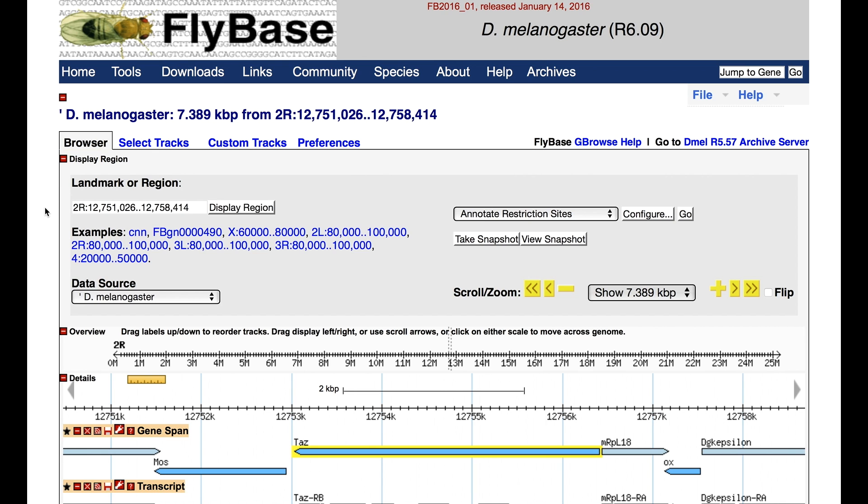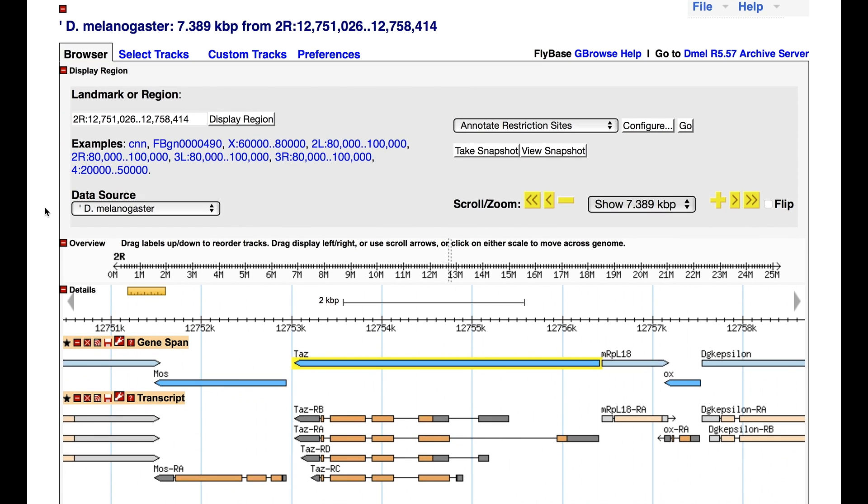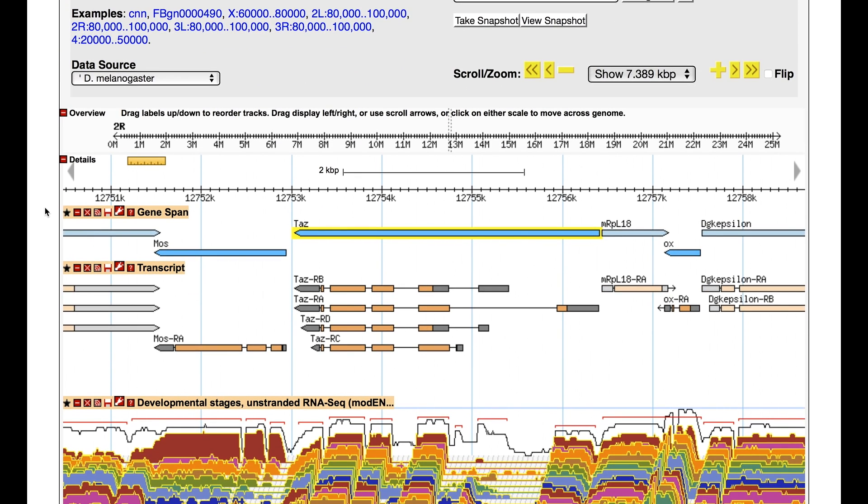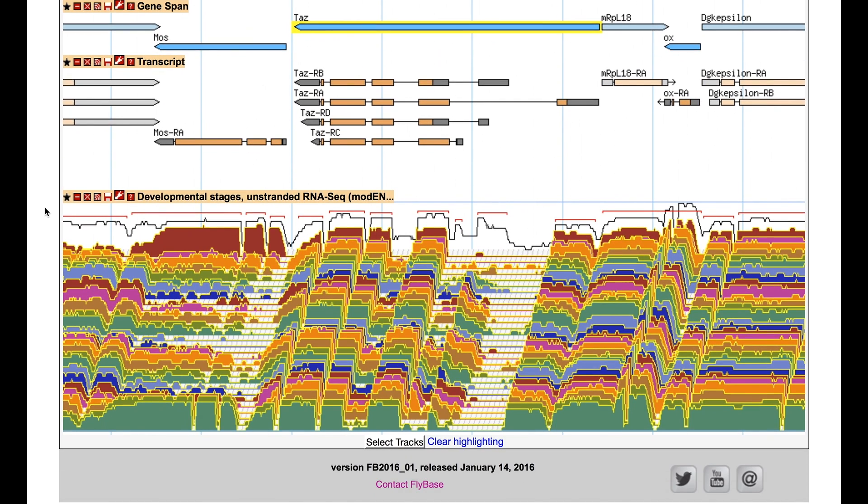Once in GBrowse, among the evidence tiers that are opened by default, you will see a colorful tier labeled Developmental Stages Unstranded ARNESIC.